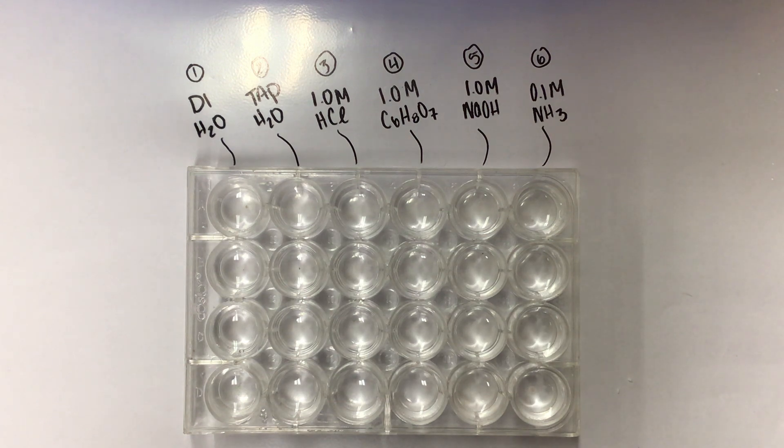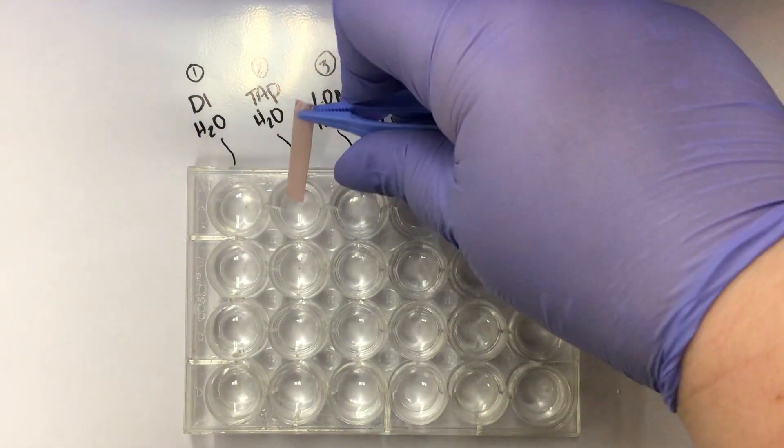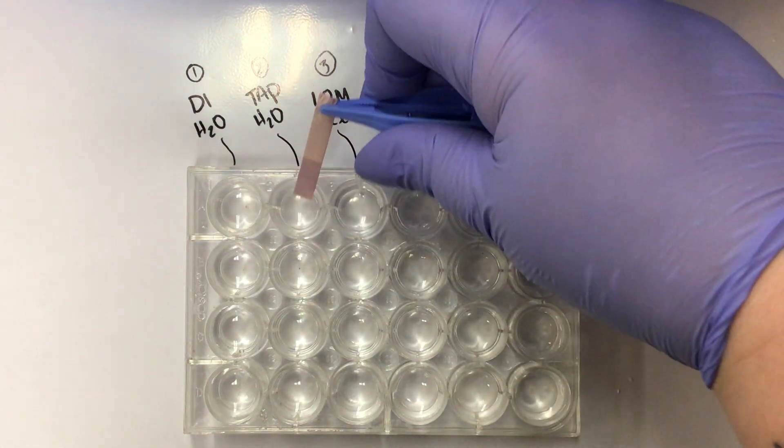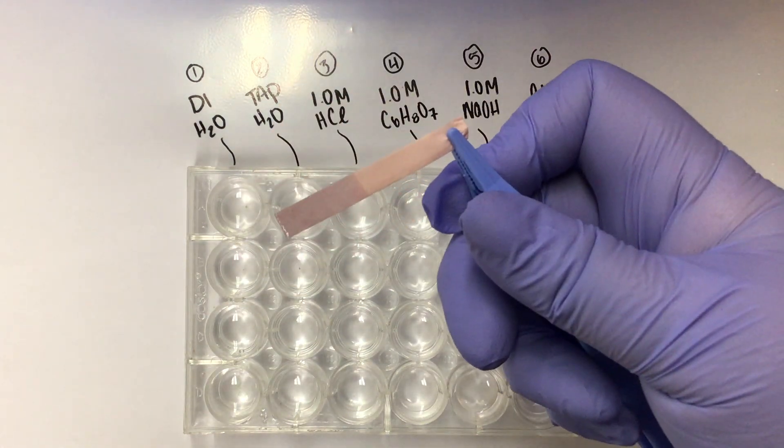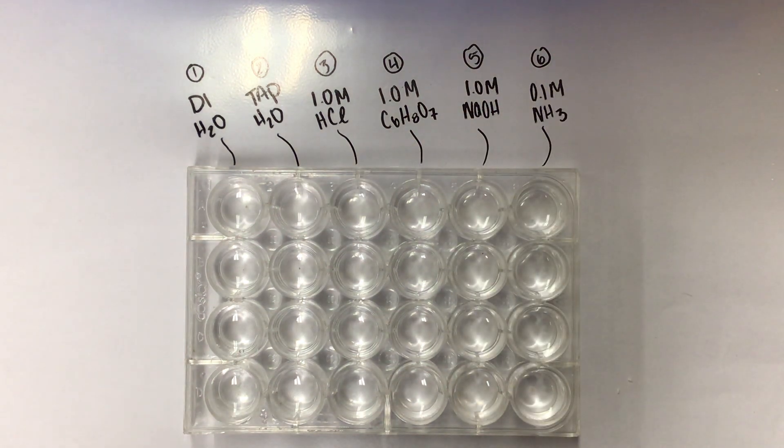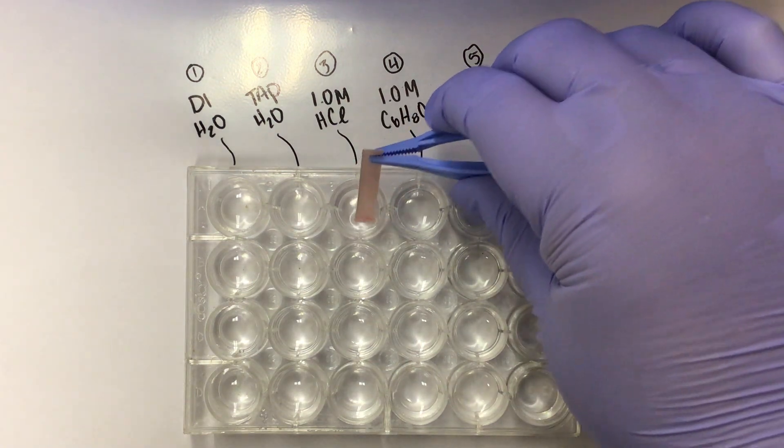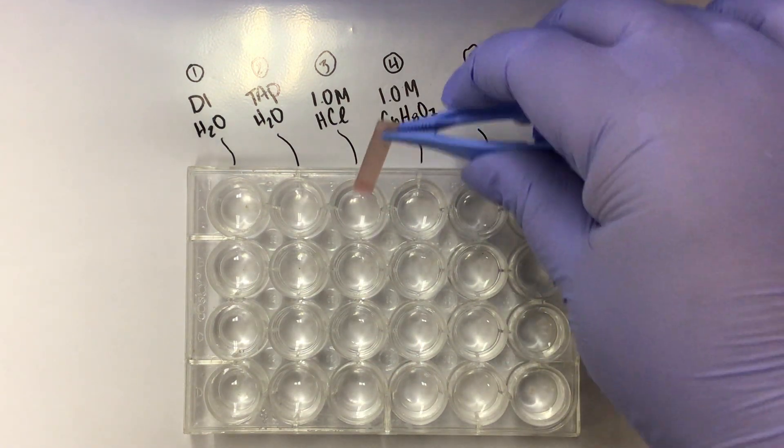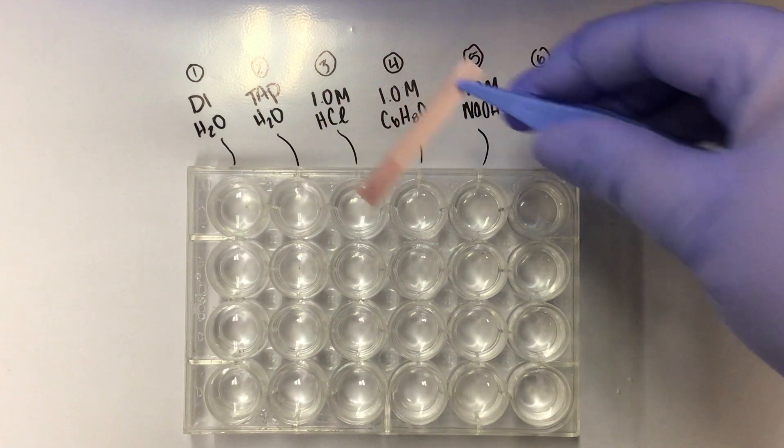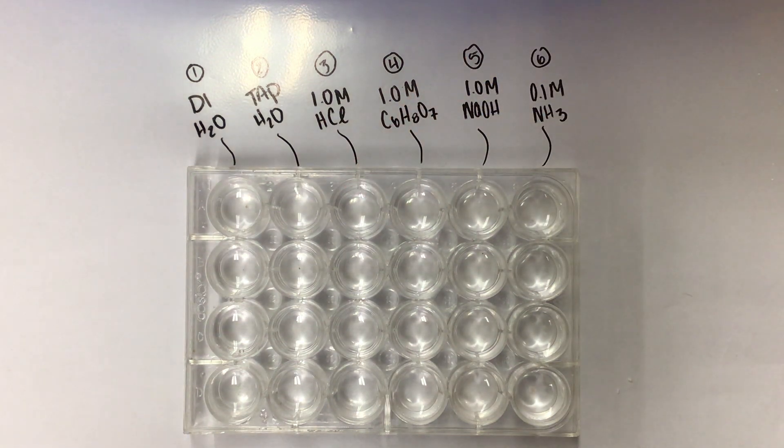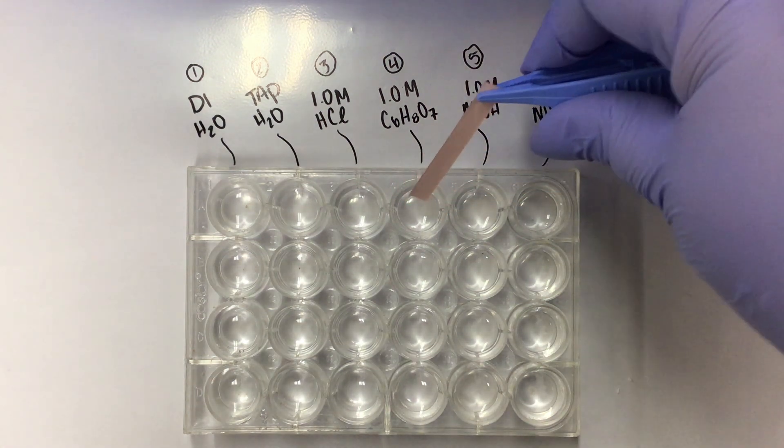Red litmus paper going into tap water. Red litmus paper going into HCl.